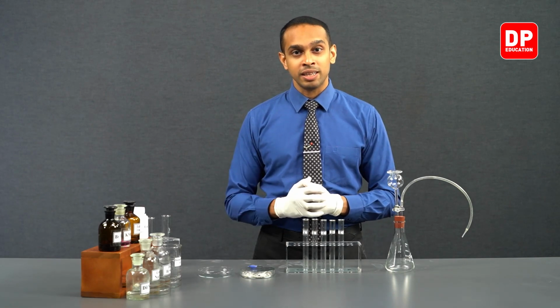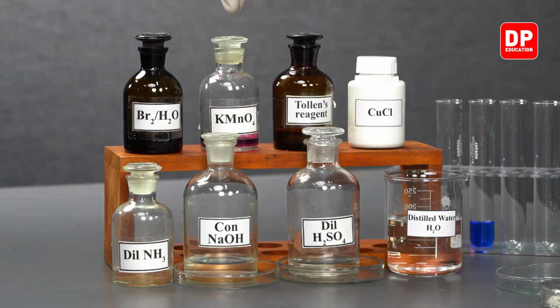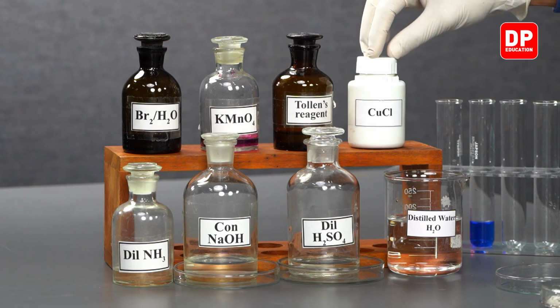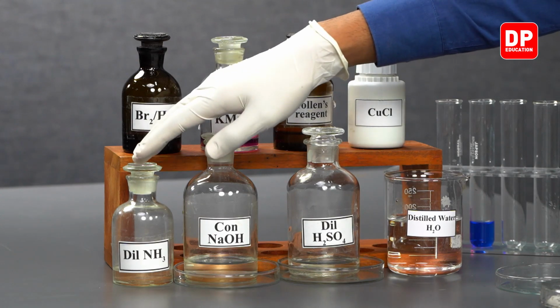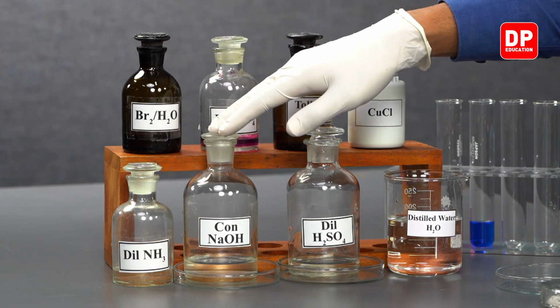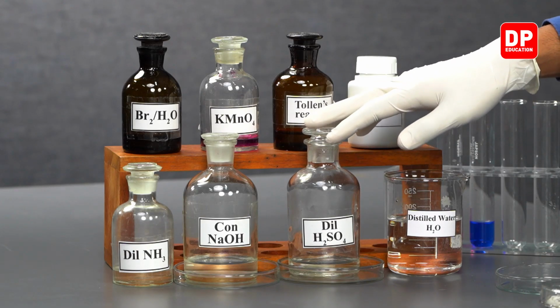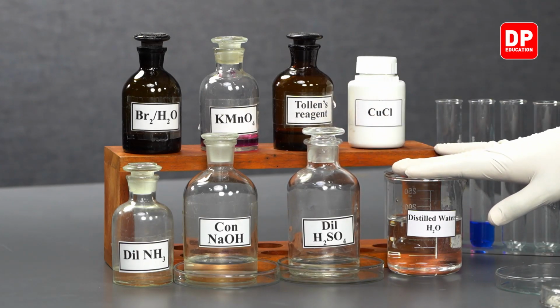So, just like in the previous part of our experiment, we have bromine water here, potassium permanganate, Tollens reagent, cuprous chloride, and we have dilute ammonia, concentrated sodium hydroxide, sulfuric acid, distilled water.